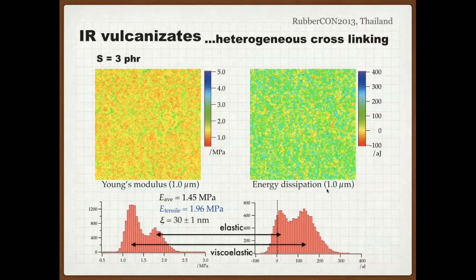Now we can have the correlation between the elastic response and the viscous responses. What I found is that in the purely elastic region, as I mentioned, the energy dissipation is almost zero, but the softer portions are viscoelastic, so energy dissipation has some value. So in this way, you can perform some viscoelastic measurement even using the static measurement. But we want to go beyond this type of measurement. This is what we want to talk about today.